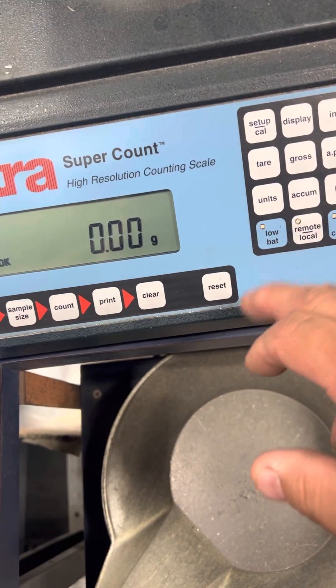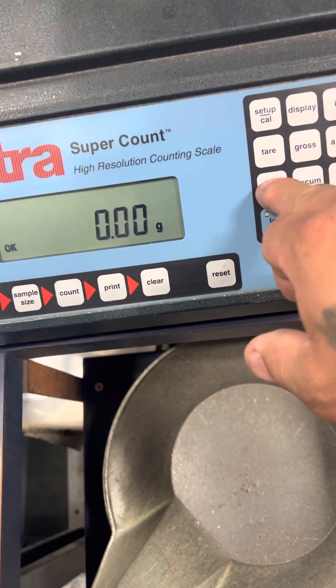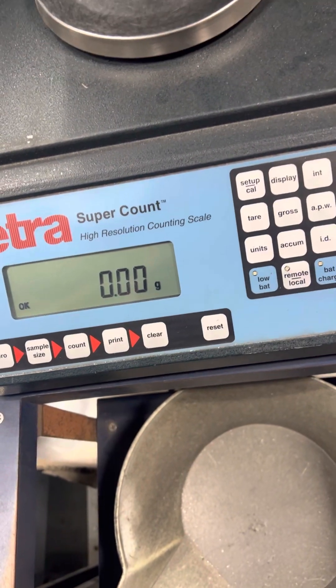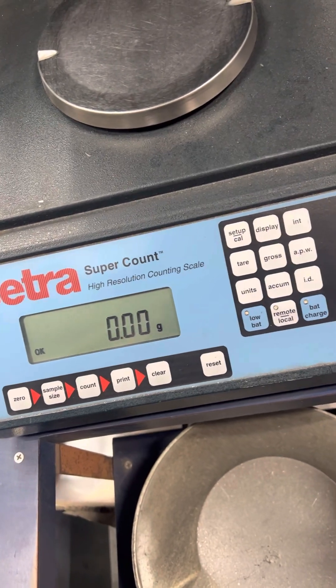And basically that's pretty much how you change or revise the units on a CETRA super count.